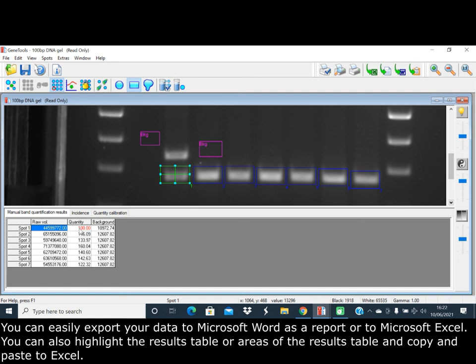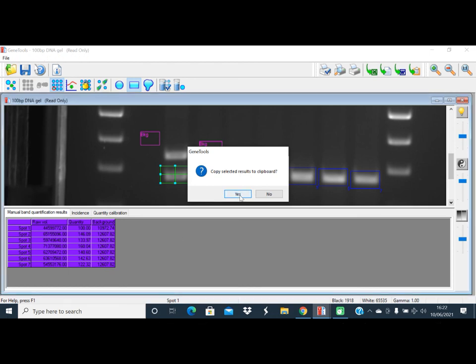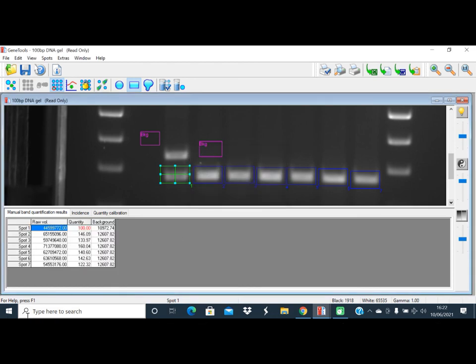You can also highlight the results table or areas of the results table and copy and paste to Excel.